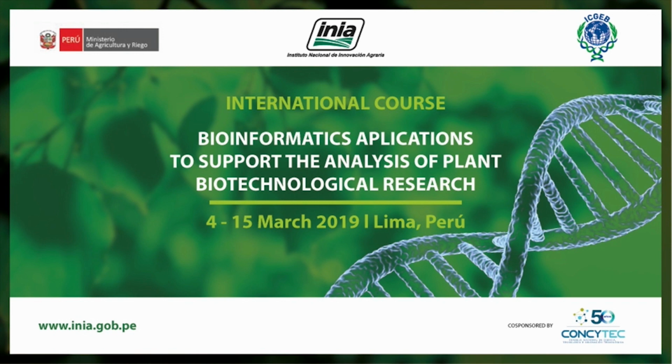Oh yeah, it's just that I look for it in different ways. What I did is just write in Google, understanding the consensus format in Clustal. And then it's going to give me a Biology Stack Exchange, and that's where all these things appear.